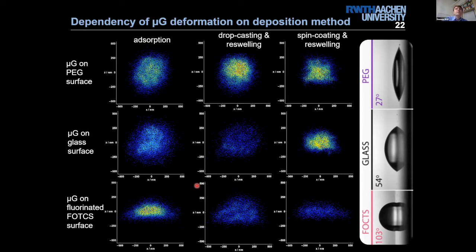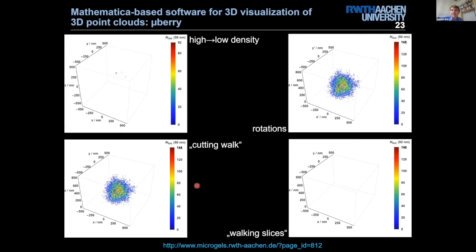So with this, I also want to make very brief advertising for our own software, so to say. This is something which comes after all the analysis is done, for example, with these 3D tracks. We were always a bit annoyed with the ways to present our data, and then some people of my group decided, let's not be annoyed, let's just make our own program.